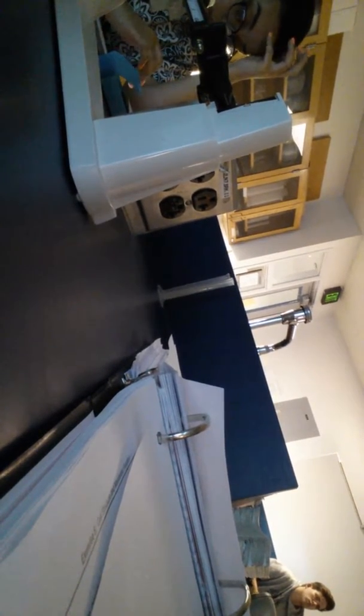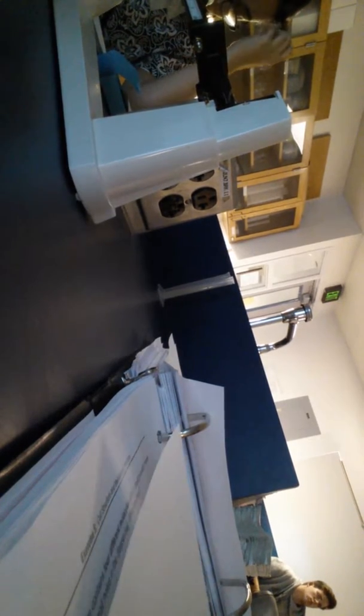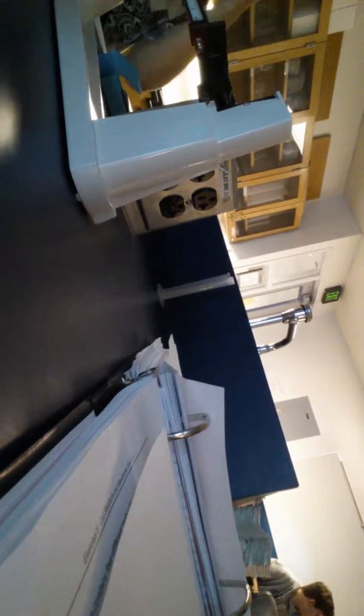You all know how to make a wet mount slide. You all know what happens if you're looking at an object and you push it away from you, it appears to come towards you. If you push it this way, it goes that way. Everything's opposite.